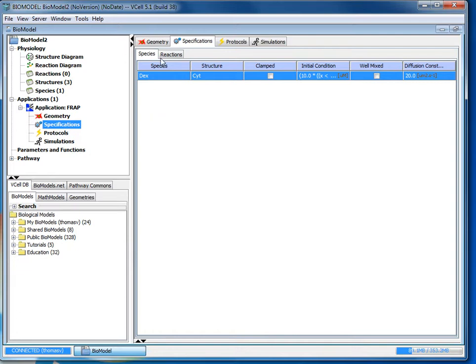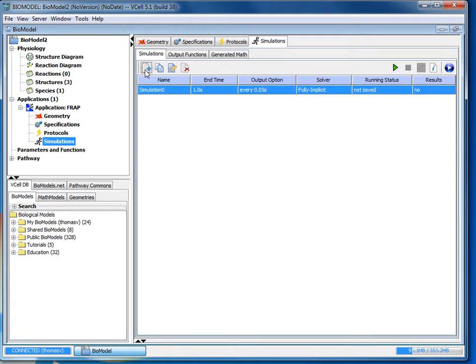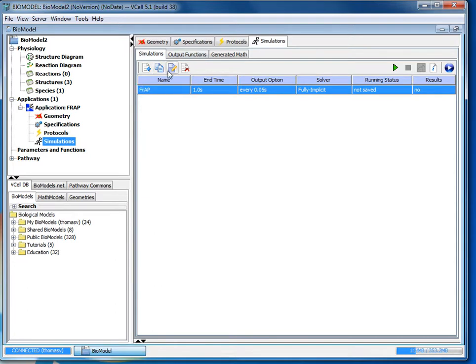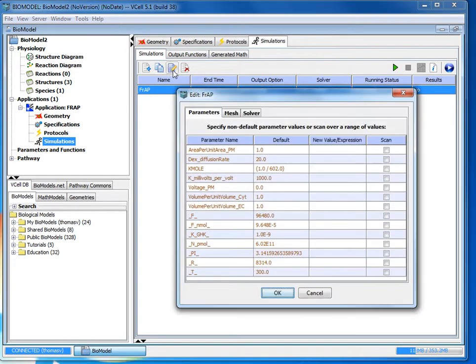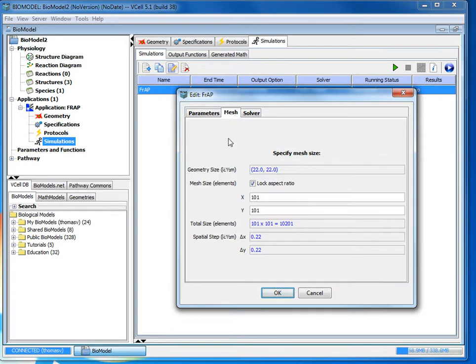So now we've set all the specifications we need and we can go to simulations. We're going to select add new simulation and if you double click in the name box you can change the name of your simulation to whatever you want. And then we'll click edit simulation and then a dialog box with parameters mesh and solver tabs will pop up.